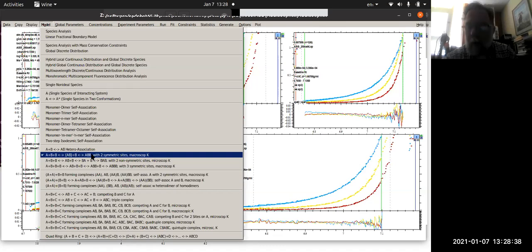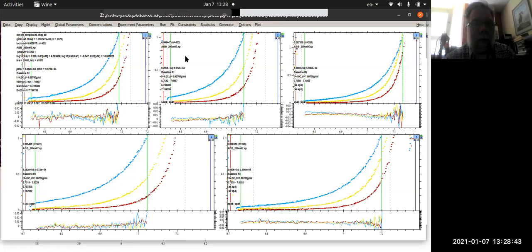So it's a kind of a complicated model that's been done here, but presumably people have reasons to believe that this is actually going to be good data. It's a difference between modeling data where you need to know that it's worthwhile using this model. When you look at this data, I could easily fit a single or two species model to any one of these curves.